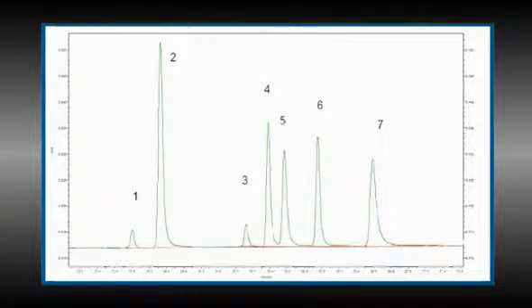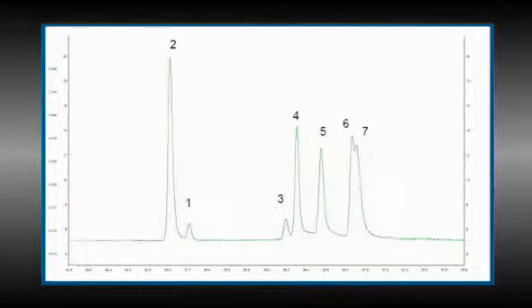No, it's not. It's good to break the issue down in order to solve it. Are we seeing a decrease in separation or an increase in peak width? Each of these symptoms may indicate a different core cause. Here's an example of a decrease in separation over time. You can see by comparing the chromatograms that we're losing some of our resolution.